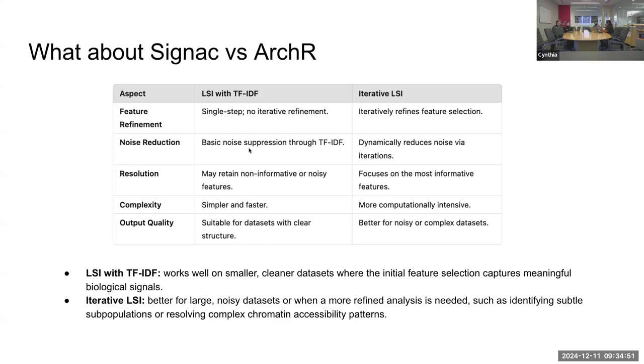Also, in terms of the resolution when using Signac, maybe there is some non-informative information, but this should be clearly shown when we have the clusters. And in the case of the approach that uses ArchR, yes, it focuses on the informative information, because it has this iterative way to reassign the nodes to the clusters.